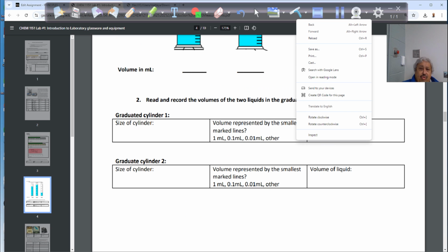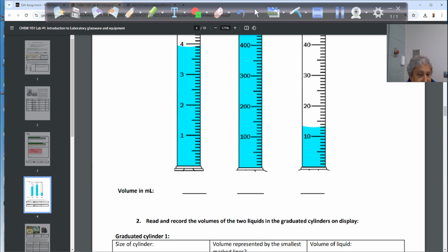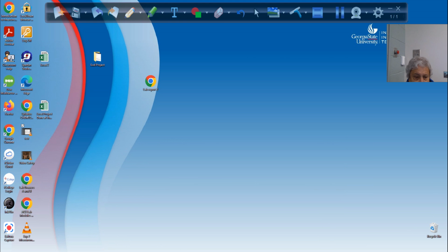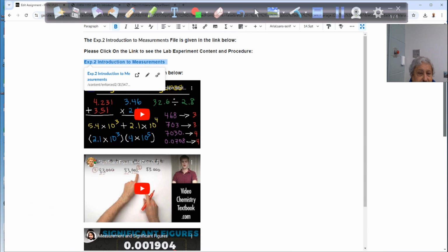Now, this is the theoretical. Now we'll come and make out of this. I hope we can get docs. Let me see. We can get the docs here.